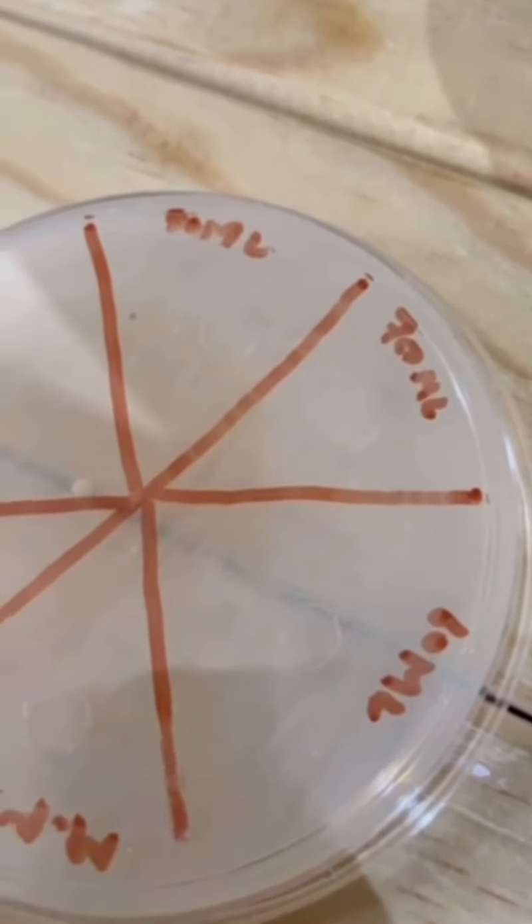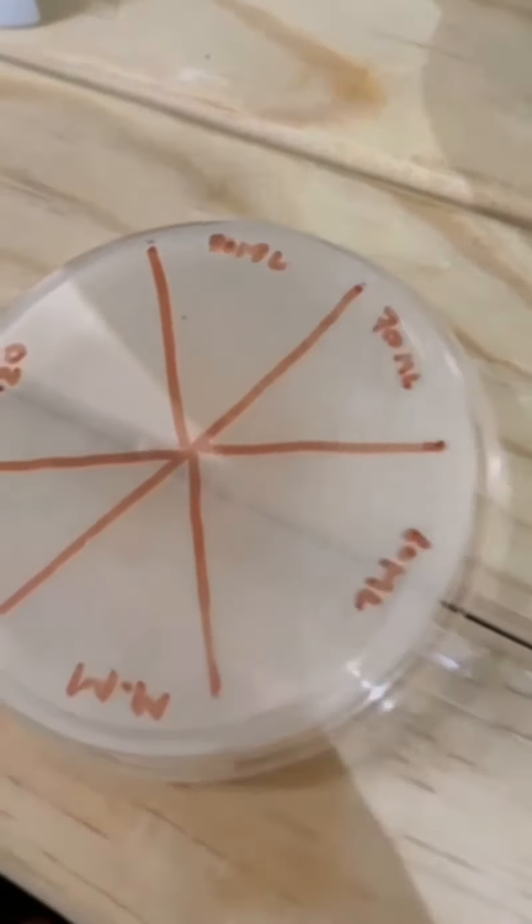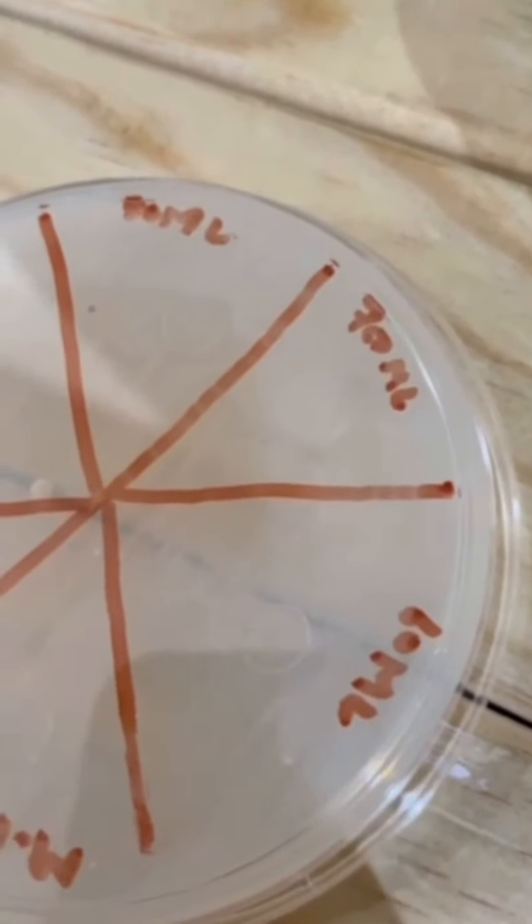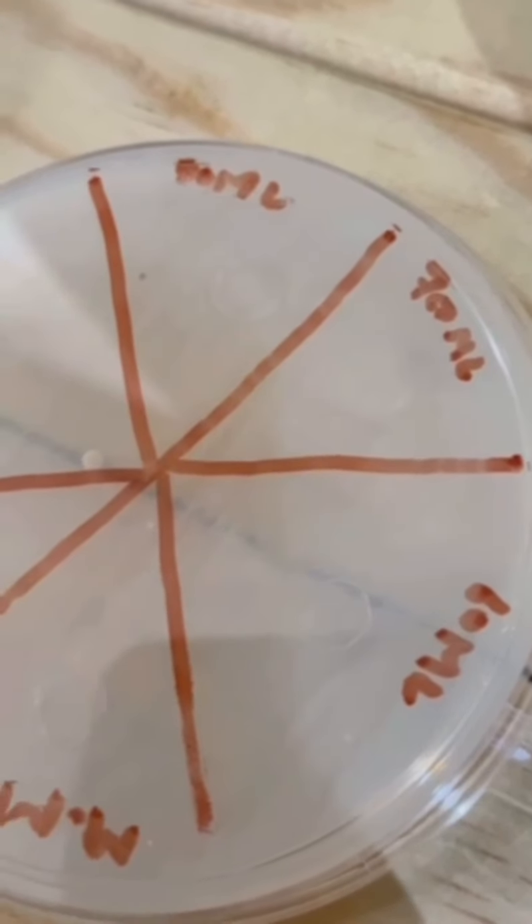And for the 80, 70 and the market made, I'm not expecting colonies, because isopropyl is the independent variable, and the zones that create on the agar plates are the dependent variable. So in these 3 quadrants the alcohol concentration is very high, so I'm not expecting zones or any holes or colonies on those quadrants.